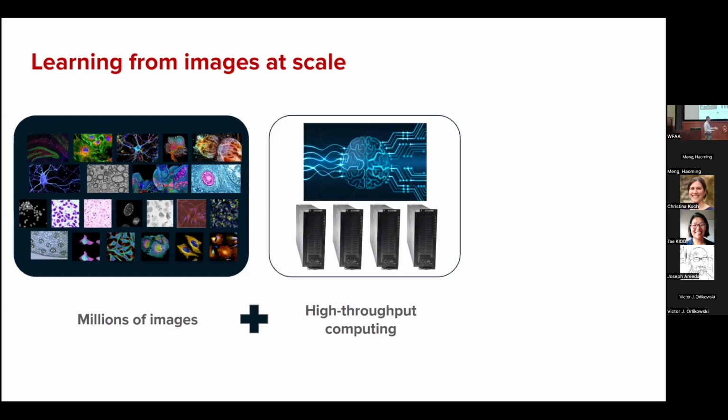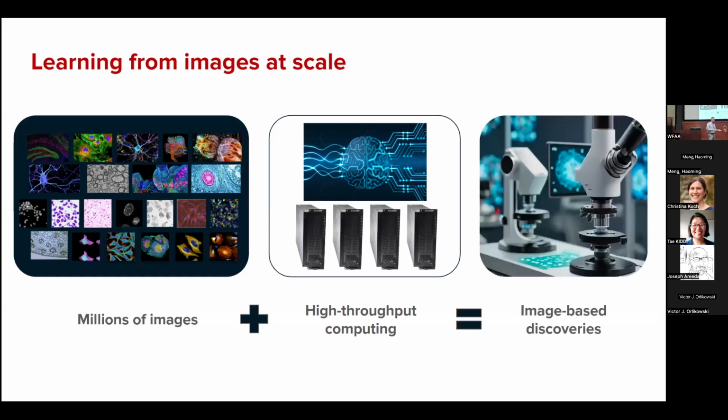So ultimately, if we are able to combine large-scale image analysis with high-throughput computing, we hope to be able to provide tools for image-based discoveries, because imaging gives us a lot of information about biological activity in cells and in tissues as well.